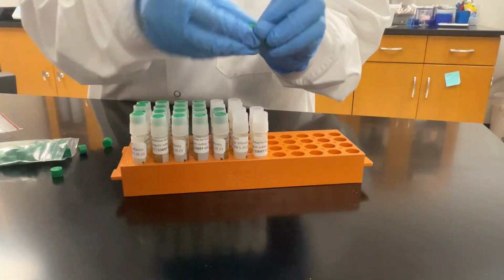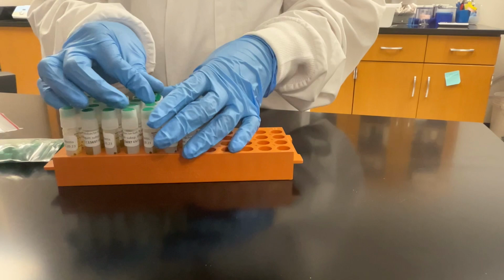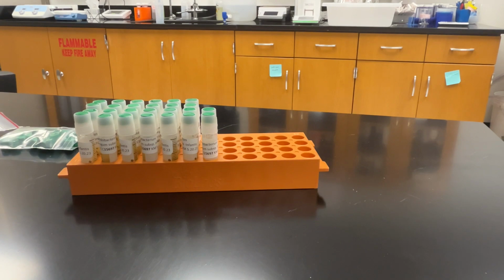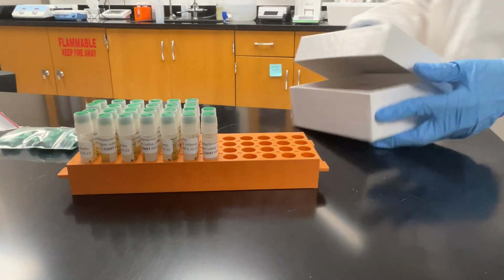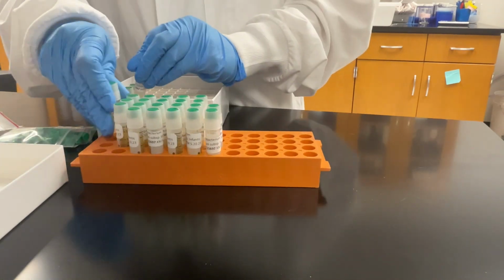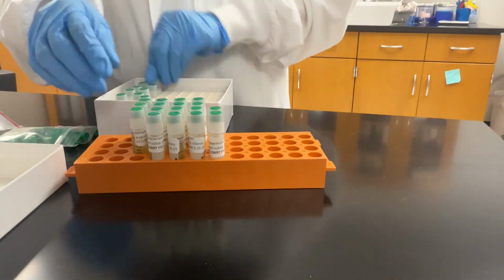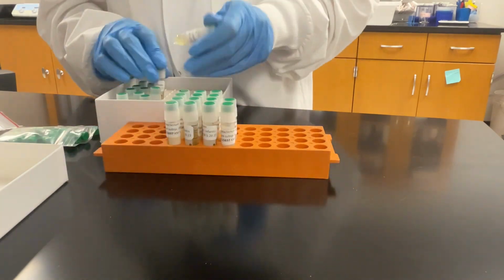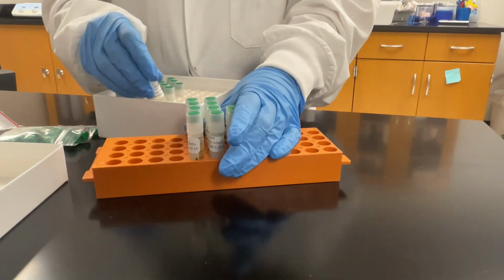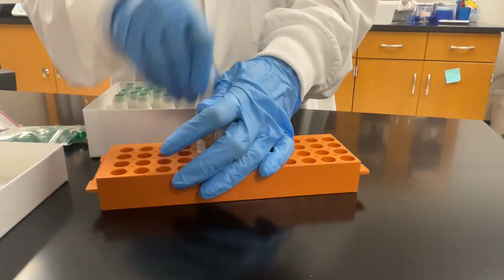Lastly, before I put all of these vials in a box, I have color-coded caps that I put on these tubes so that it makes it a lot easier for me to identify them when they are still in the box, since they will be going into the -80 freezer, and it is a little bit hard to rummage through these boxes whenever you're looking for a specific tube. So after I did this, I put them in a freezer box so that they will be ready to stick into the freezer.